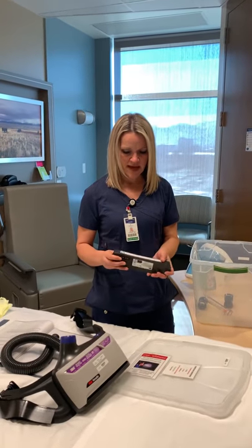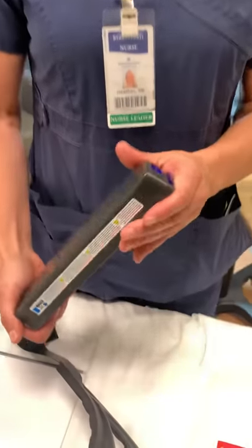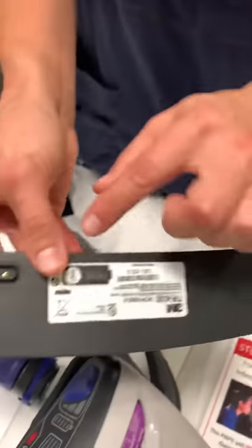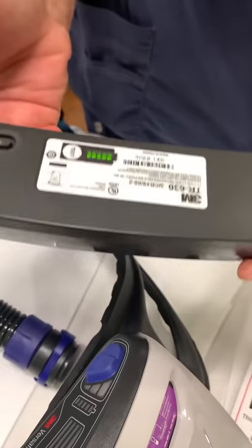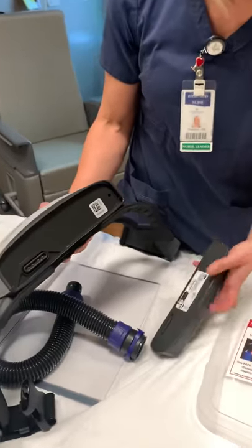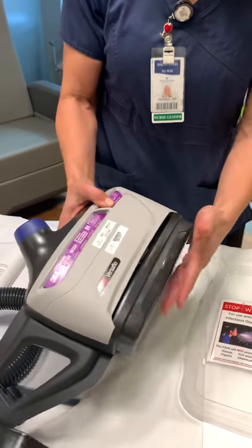First, when we get the battery, we want to make sure that we have enough battery life. There's a little test button — you're just going to push on it and make sure that you have battery. Then you're going to clip your battery pack into your PAPR. Feel it click in so you know it's locked.